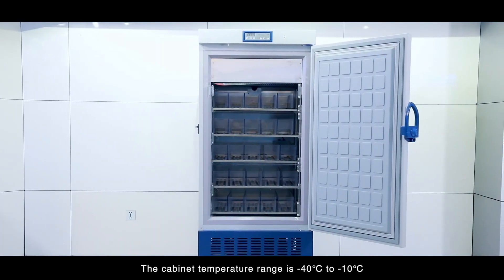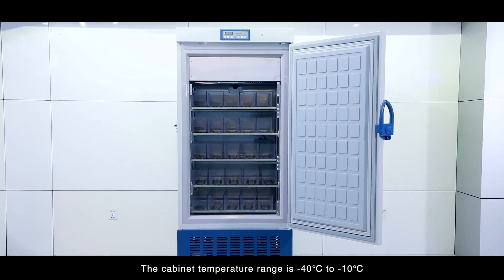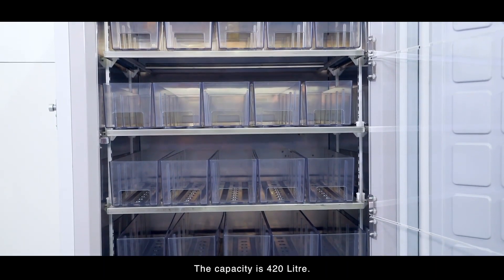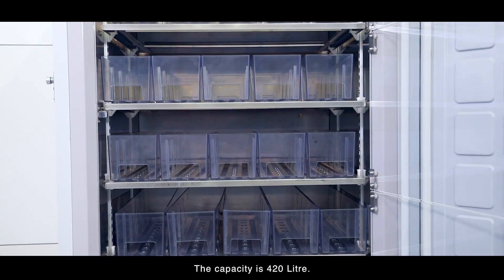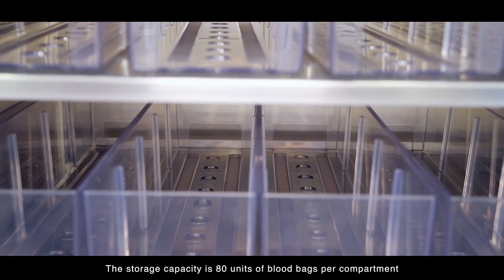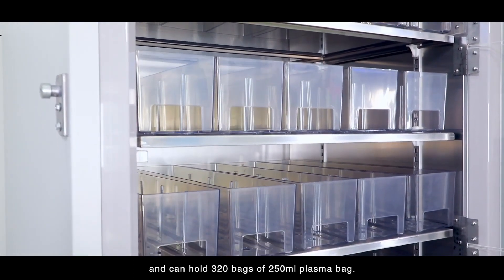The cabinet temperature range is minus 40 degrees C to minus 10 degrees C at 10 to 30 degrees C ambient temperature. The capacity is 420 liters. The storage capacity is 80 units of blood bags per compartment and can hold 320 bags of 250 milliliter plasma bag.